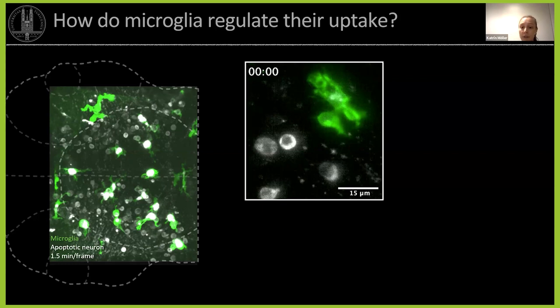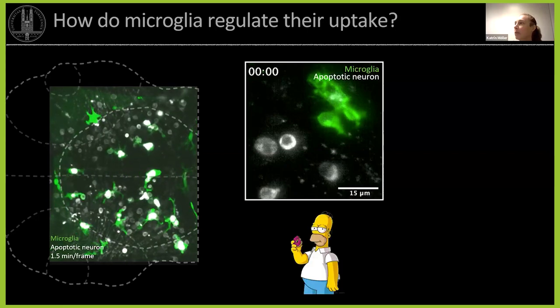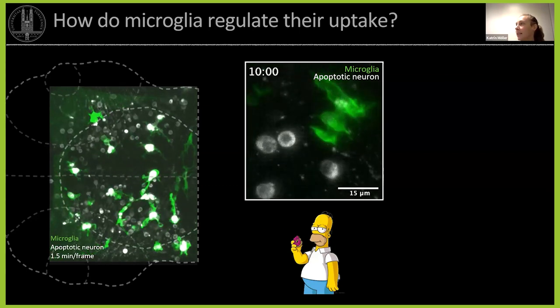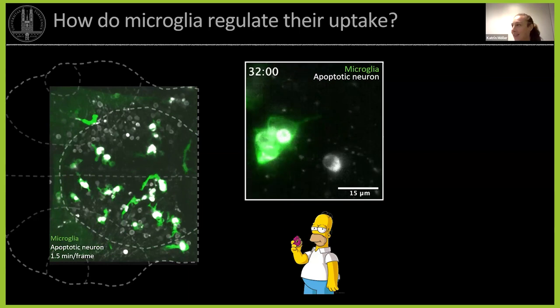And this technique often generates very large amounts of data. I often had to post-process terabytes of data after one session. So you can imagine how helpful having the BioImage Archive on my side was at the end. But now by zooming into one of these cells, here you see them collectively moving around within the brain. And when you zoom into one of these cells, you can see how it's just happily going around there, eating its donut-shaped apoptotic cells.